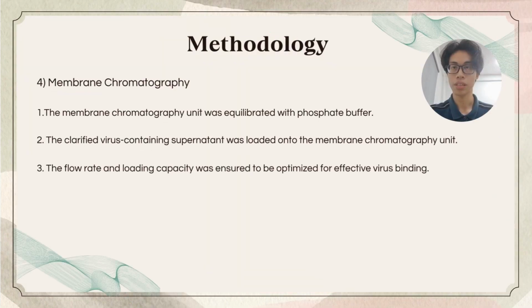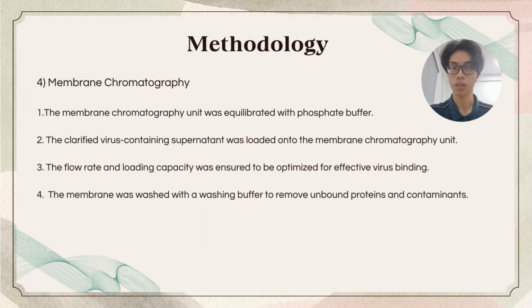The next step is carrying out membrane chromatography. The membrane chromatography unit was equilibrated with phosphate buffer. Next, the clarified virus-containing supernatant was loaded onto the membrane chromatography unit, ensuring that the flow rate and loading capacity were optimized for effective virus binding.